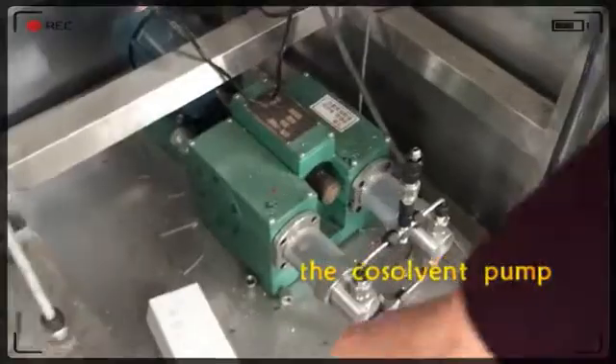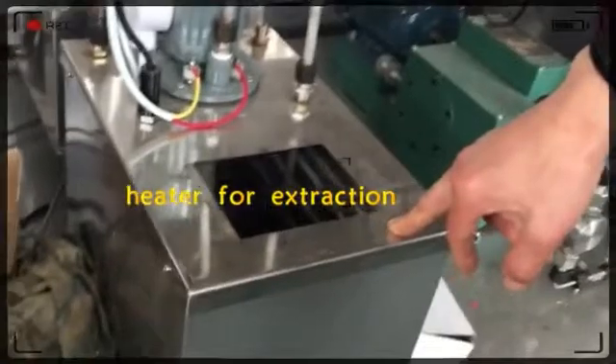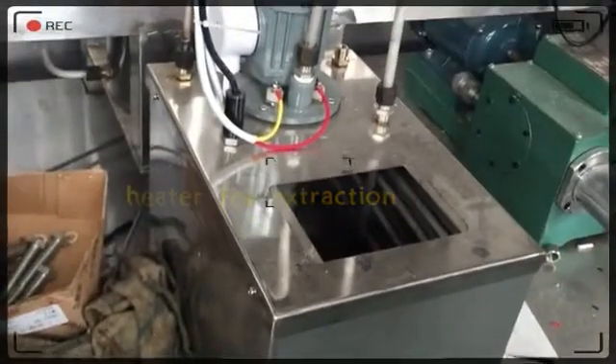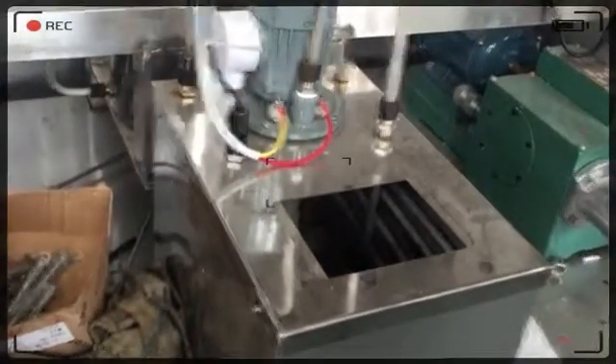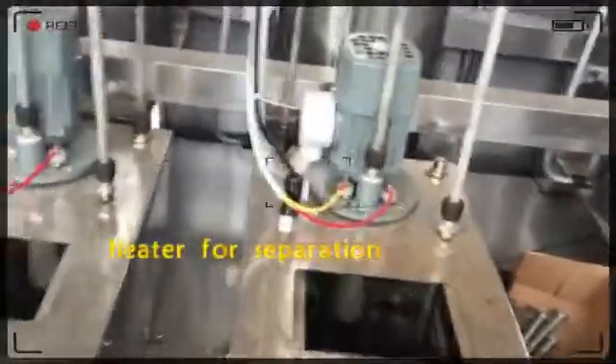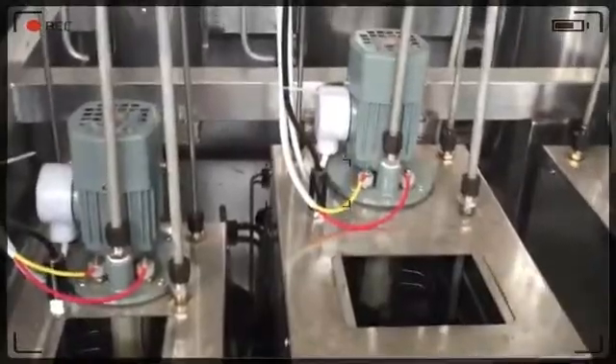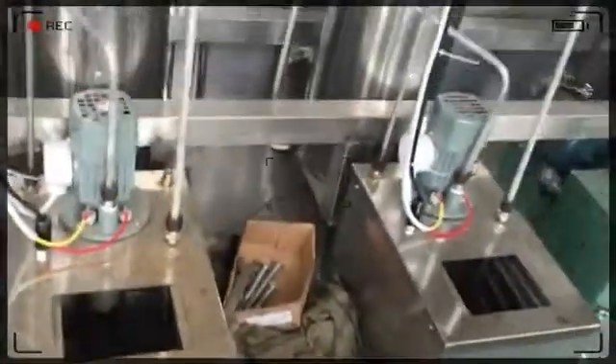This is a heater — a heat exchanger for heating the system. It heats the extraction vessel, and there is another one for the second extraction vessel. There are also another two for separation vessel heating, helping to increase the temperature inside the extraction vessel.